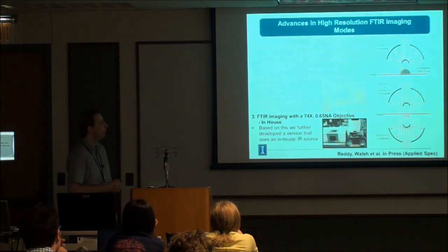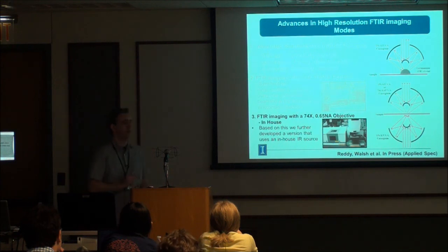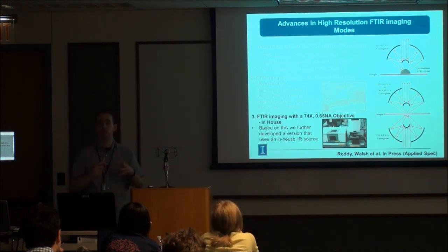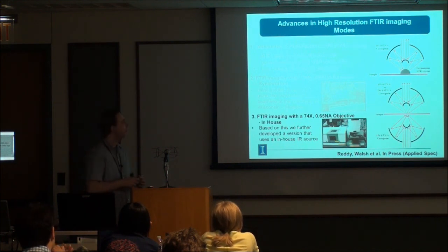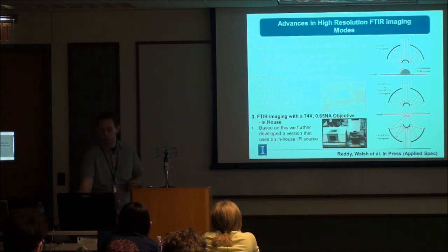Okay, so this was all good and well, but as I said, a lot of my work's been driven towards clinical translation of these technologies. And we're not going to have a synchrotron outside the back of every hospital. So we actually had one of our grad students, Rohit, work on the theory. He does a lot of modeling of, actually this is the first time anyone's done this, modeling of infrared microscopes. And basically we could adapt one of our existing instruments, the one next to the one you worked on last week, to be able to do this same type of imaging using a glow bar source. And we just got this accepted.